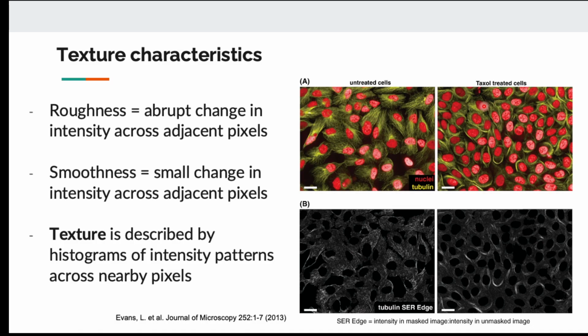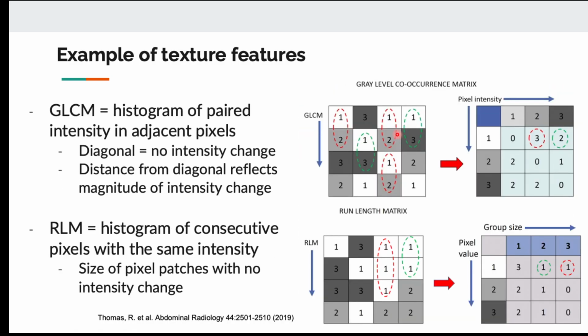But if you want to do computational analysis, you have to be able to transform that description into numbers. And this kind of histogram calculation is one way to turn the description of fiber structure and smooth or rough change in the color into something that can be described as numbers, so that we can develop algorithms, develop models for it.